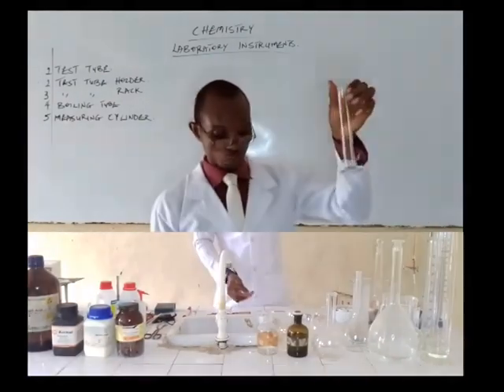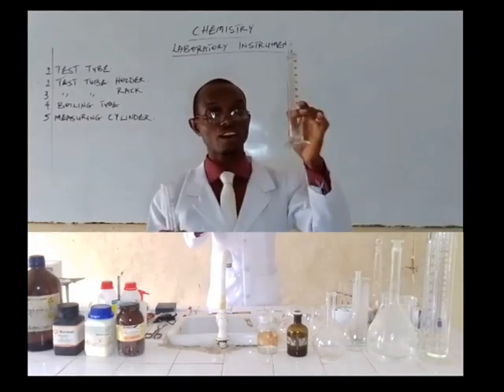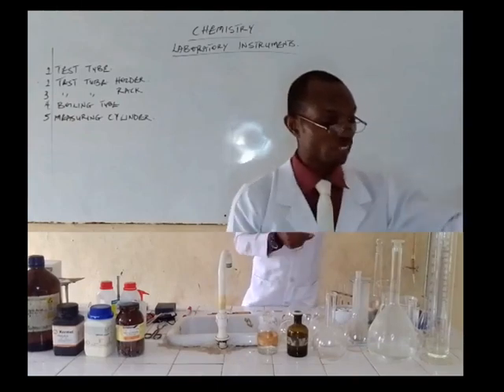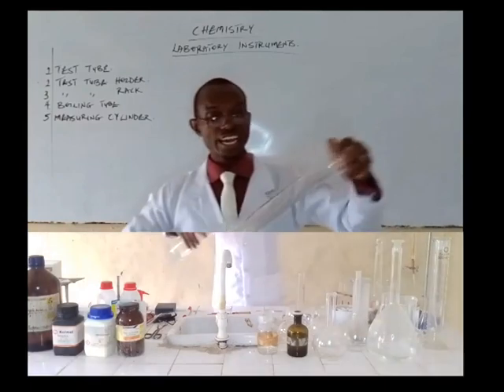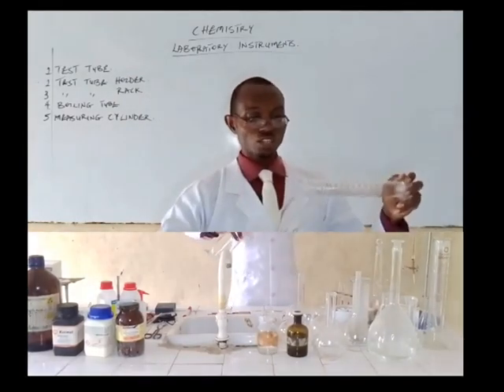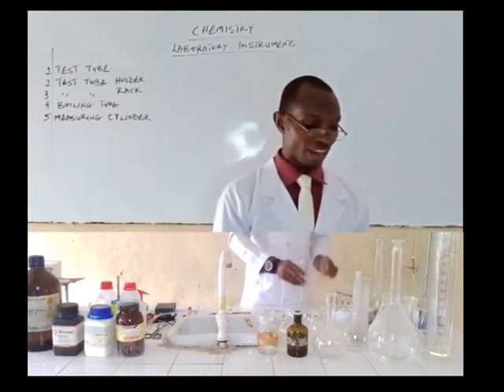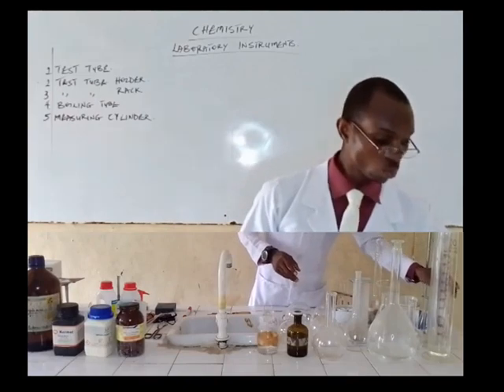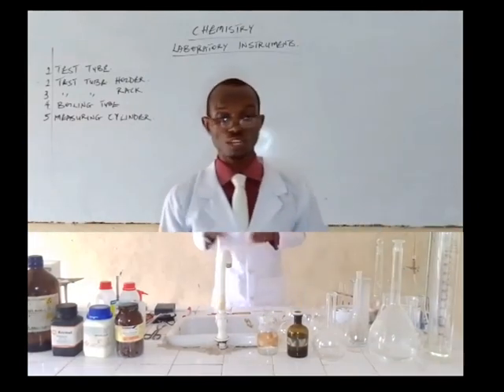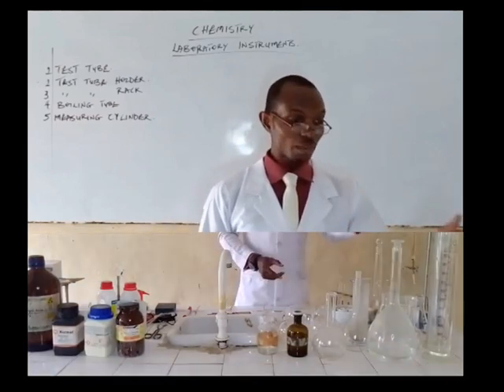Here I have another one which is a 15 ml measuring cylinder. We have other types as well — this one here is a 100 ml measuring cylinder, I have a 500 ml measuring cylinder, this one is a 250 ml measuring cylinder, and this one is a 1000 ml or 1 dm³ measuring cylinder. They are of varying sizes. Depending on the quantity of the chemical you want to measure, you use the measuring cylinder that fits. If you want quantities more than 1 dm³, you use the 1 dm³ and other cylinders to get the required quantity.